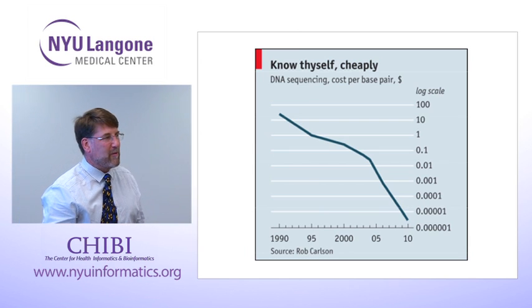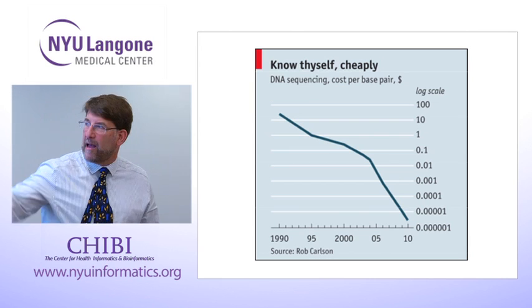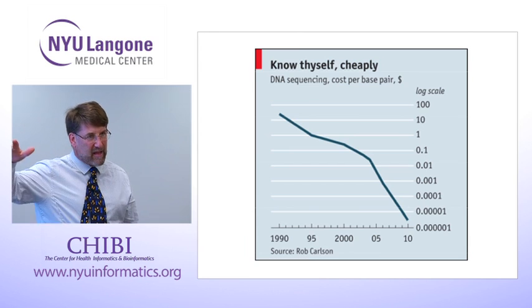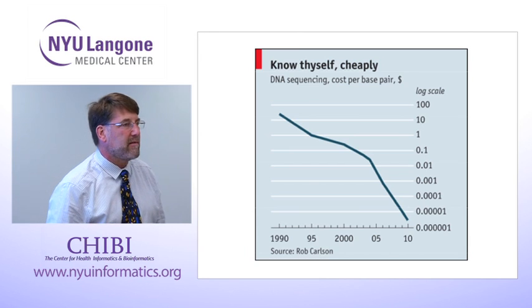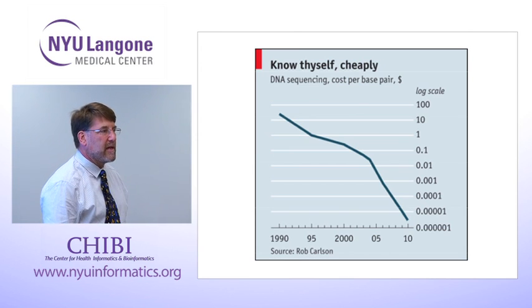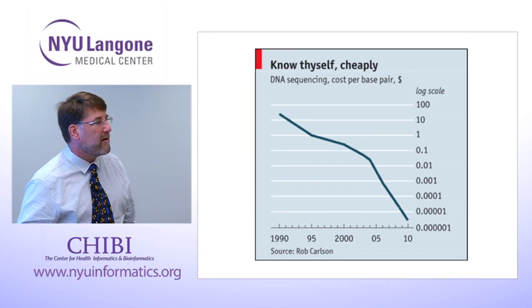This is just to show what I mean about the rapidly dropping cost of sequencing, and that the angle of drop in cost per base pair sequenced, if anything, is increasing. It's getting cheaper at an ever faster rate. And I believe it's been in the past 6 months or so that RNA sequencing has definitely been proven to be cheaper per sample than a microarray.